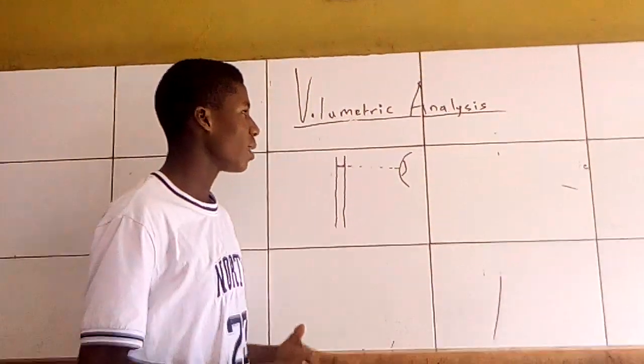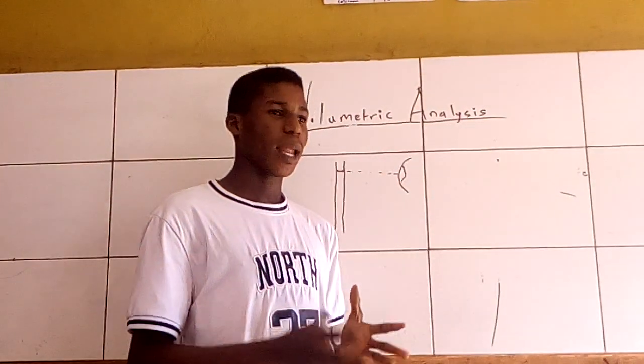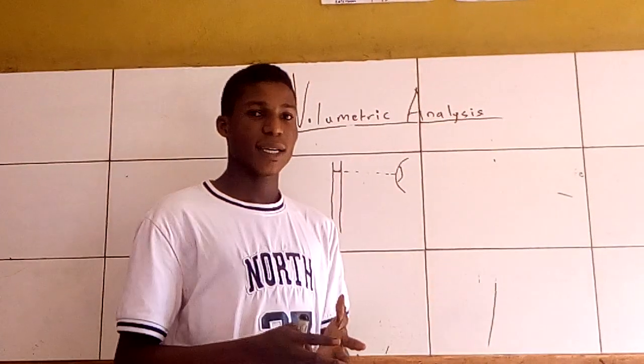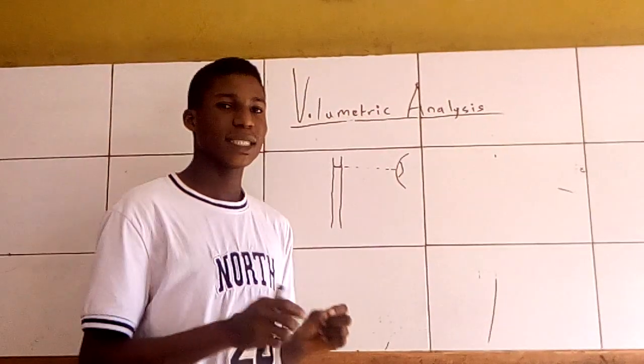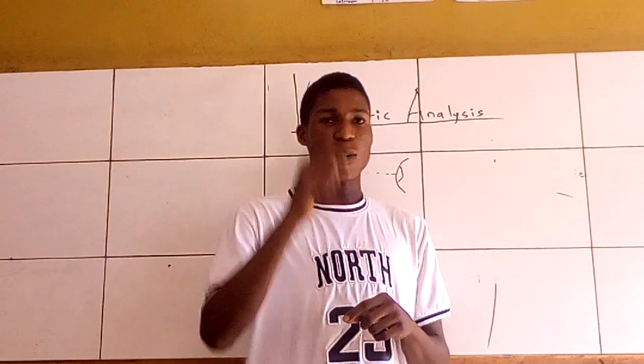So you should rinse your burette with the acid that you use. And make sure that the tap is closed when you pour the acid.